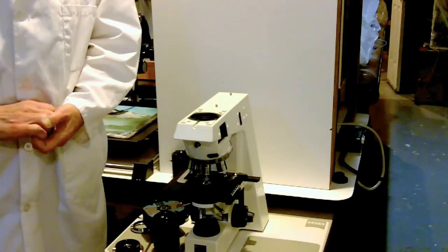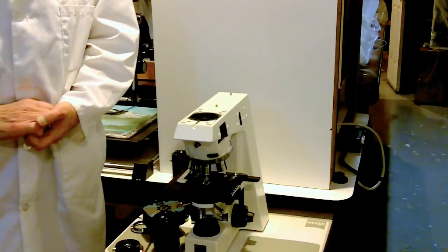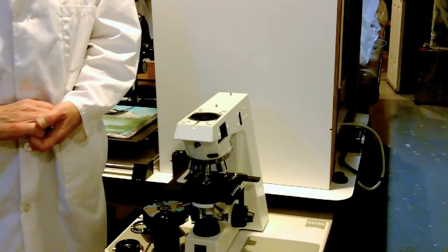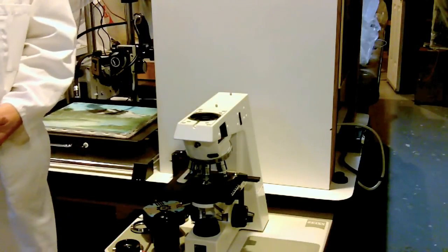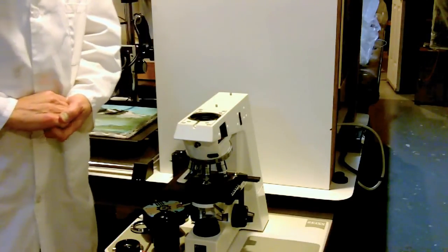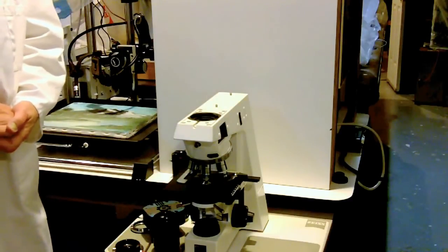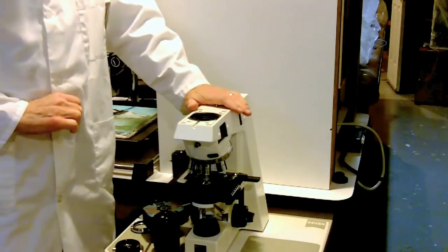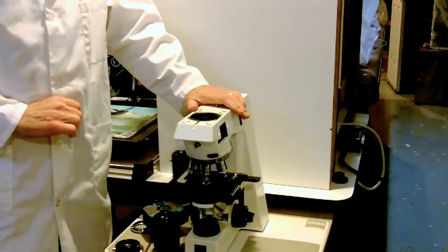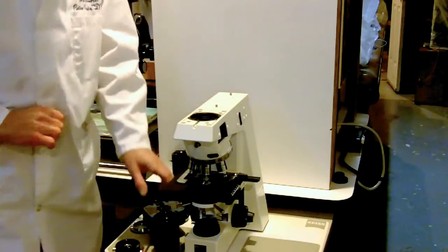They can all be updated and we believe in the RRR - reduce, recycle, and reuse category for optical microscopy. So here we have a first generation Zeiss Axioscope upright biological microscope.